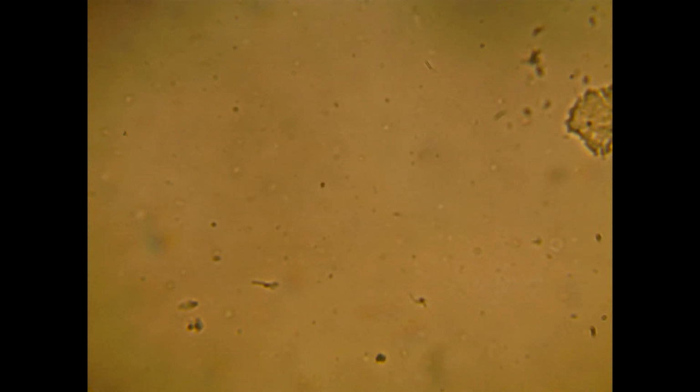In the case of worms, the worms are doing all the work for you. But there's bacteria involved there too, because they're going to be in there, and then you're creating a richer environment for more bacteria. You're creating more carbon material, more food sources for bacteria, so they're going to grow. And of course, worms are going to have them in their digestive system, just like we have bacteria in our digestive system. Well, the worms do too. So that's part of what we're looking at. And these bacteria were either bacteria that like the other guy zipping around there at the bottom.